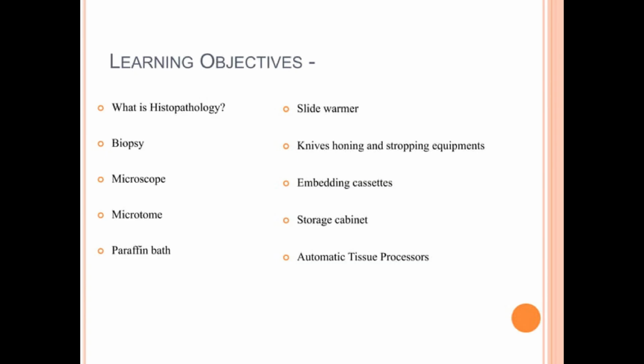What is histopathology? Histopathology is the study of tissues to understand their structure and diagnose diseases. Biopsy, microscope, microtome, paraffin bath, slide warmer, knives, honing and stropping equipment, embedding cassettes, storage cabinet, automatic tissue processors.